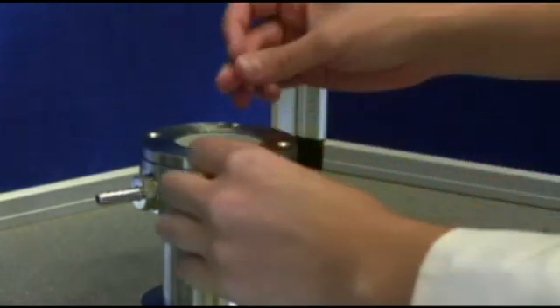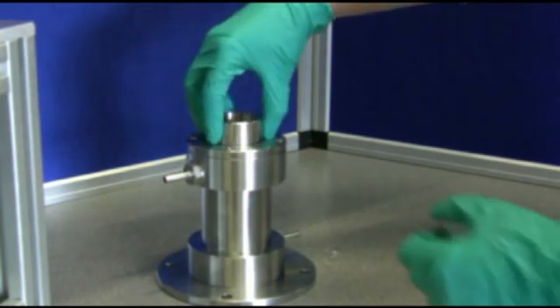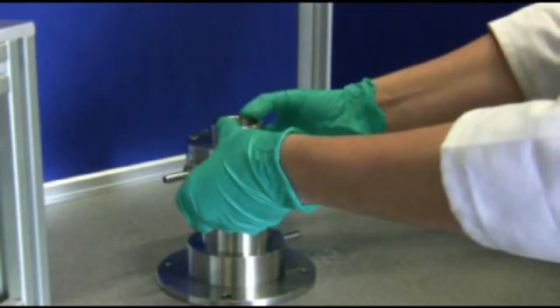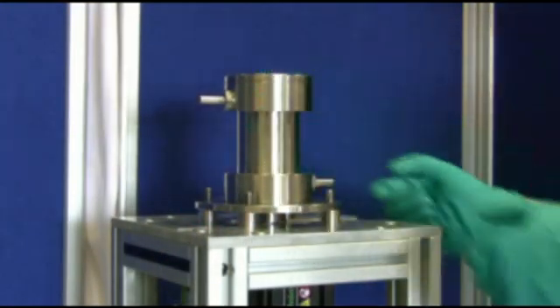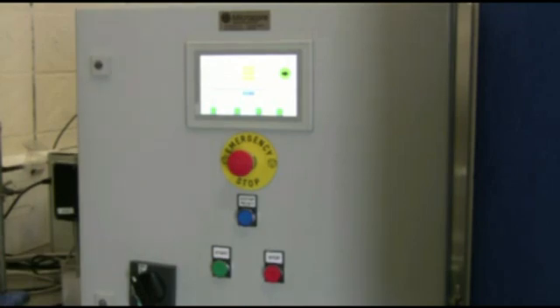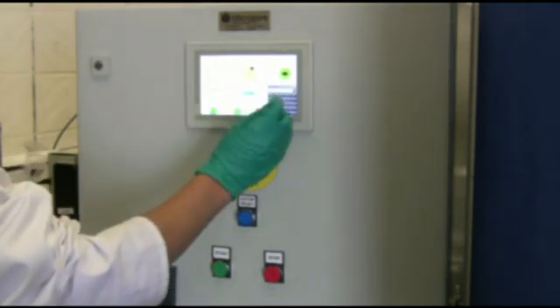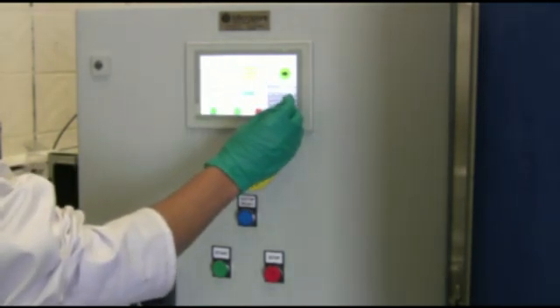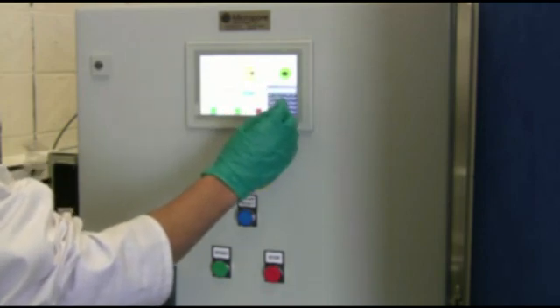It's fixed up with the set screws. Here's the rotor with the membrane on it, slots inside. And the whole assembly fits on top of the oscillating electric motor, which is controlled by a control panel. It's got a touch screen control panel, and it's possible to set the frequency and the amplitude of oscillation.